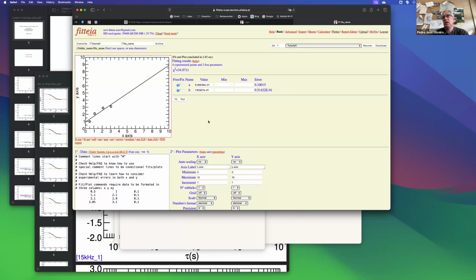So it's basically a choice of yours as to the software you use. Okay, so you have A and B, the coefficients A and B. I told you that we are minimizing the chi-square, and I will be able to show you. Below this plot that is generated automatically, there is a series of links to several files that we might find interesting.